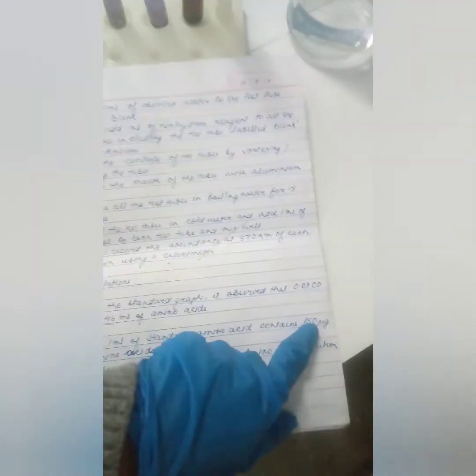The standard amino acid in this experiment is 200 microgram per ml. In the original experiment they use 150 microgram, but we are using 200 microgram.